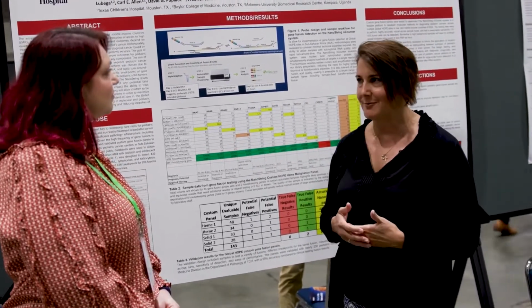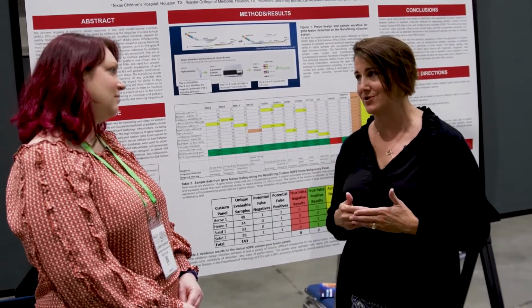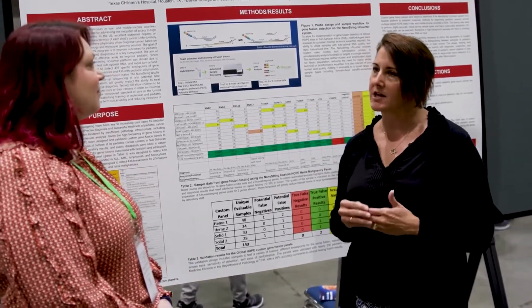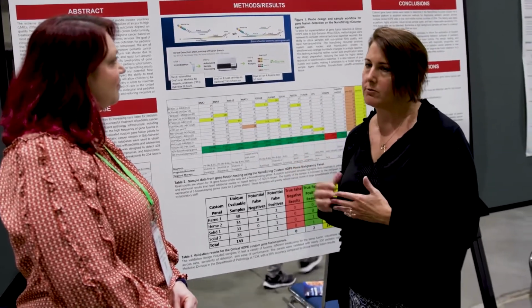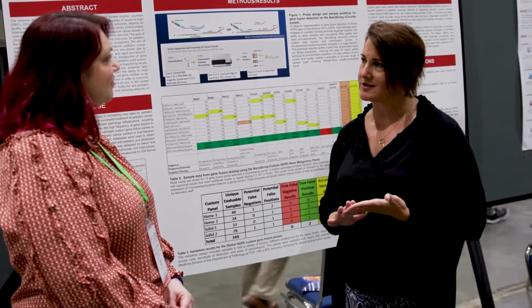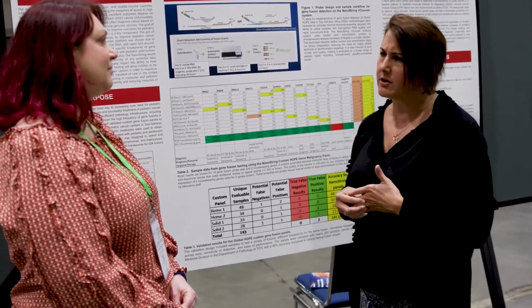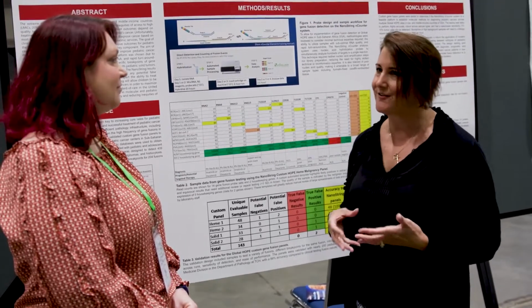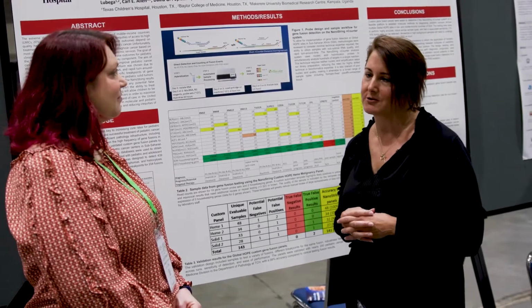We don't have a big informatics team right now. We can't go straight to next gen. We don't have a lot of people trained in genomics. So we had to think about what can we realistically do. I think some advantages that why we chose this assay, we can work with very poor samples, very small amounts of samples, and with very minimal hands-on time. We don't have a large lab to do this. We have minimal folks on the ground.